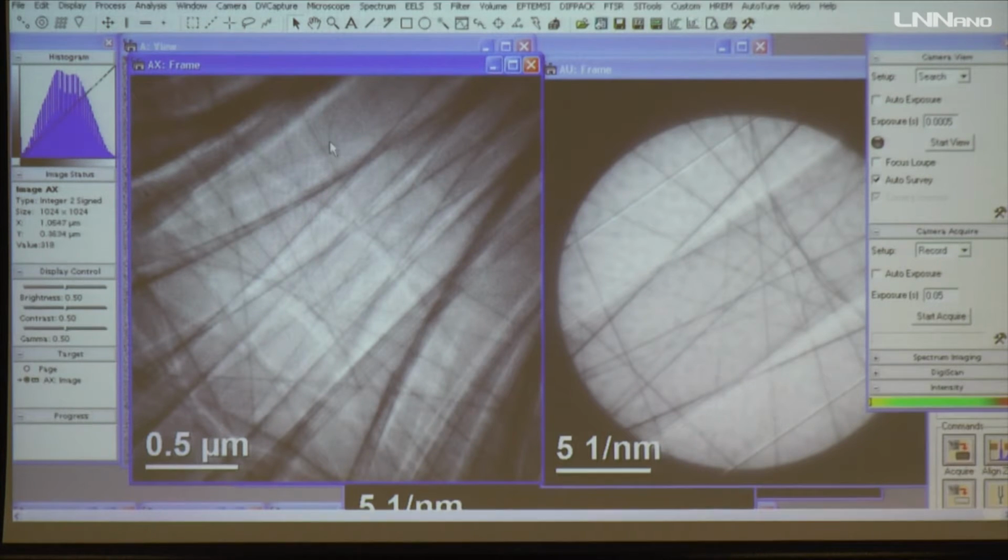I have an example in my Monday class. I will try to show you how these Holz lines are affected if there is a nanoparticle. It's really very straightforward to see how the Holz lines move, translate, or split, or what happens to them if you acquire from a single nanoparticle.